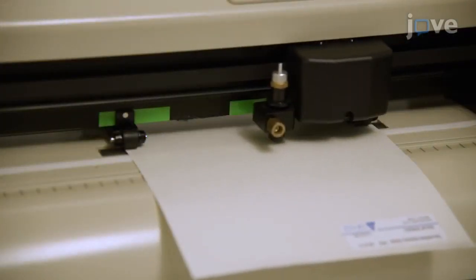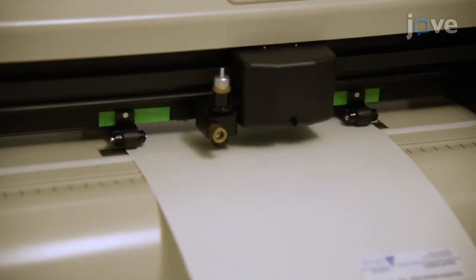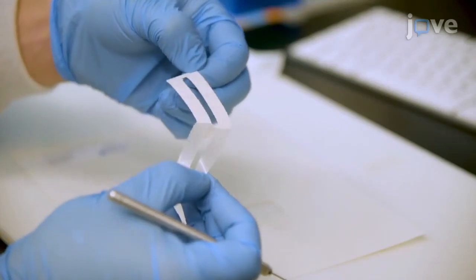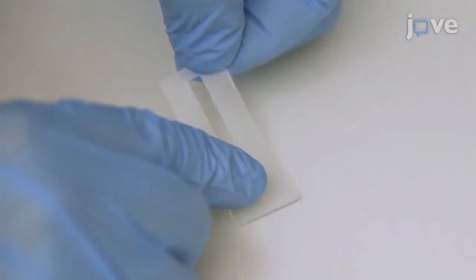Use an electronic cutter to cut a 41 by 2.25 millimeter channel into a 50 by 20 millimeter piece of double adhesive sheet and peel off the plastic side of the protective cover. Align the edges of the piece with the edges of the quartz slide.